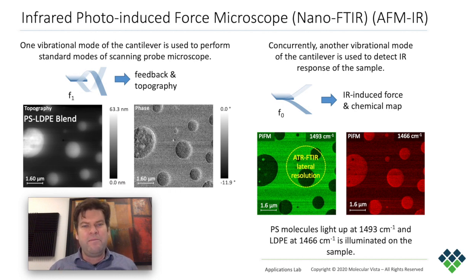Now, in the dynamic mode, we become much more sensitive to the forces present on the sample surface. This will allow us to get this really high spatial resolution.